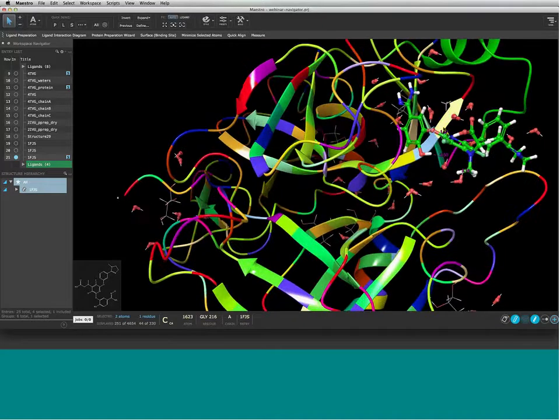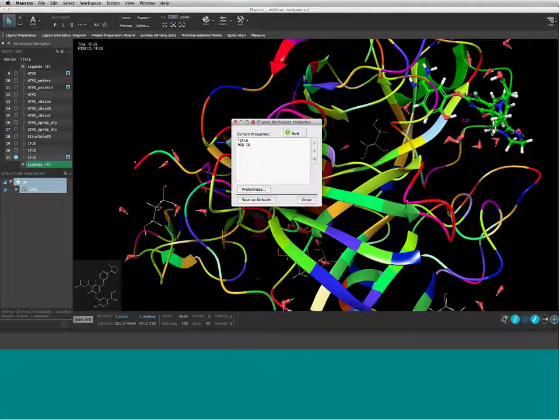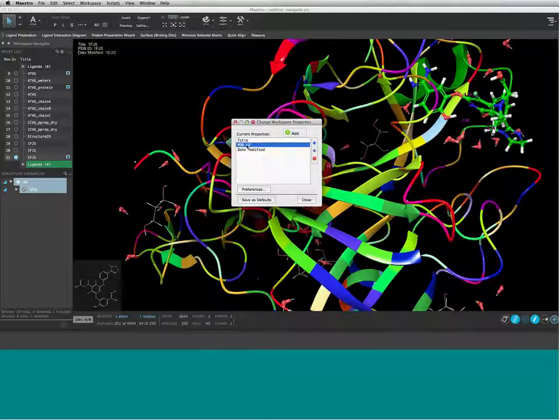selection. The last thing we want to talk about is modifying the workspace properties. Laura has this hidden in her workspace right now, but in the top left, she'll hover over the area and it'll give you this little title. She can click on that once, and that will make it visible. Then you can click on it again to quickly add properties from your project table, or remove or reorder them, and it will always be visible in the workspace.